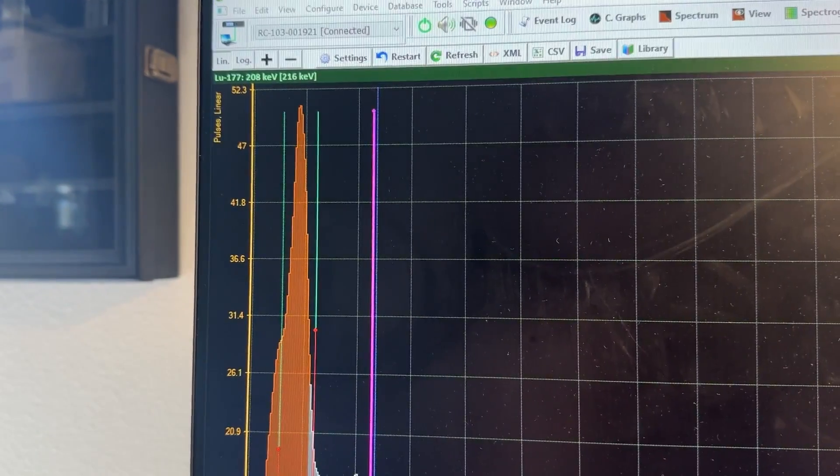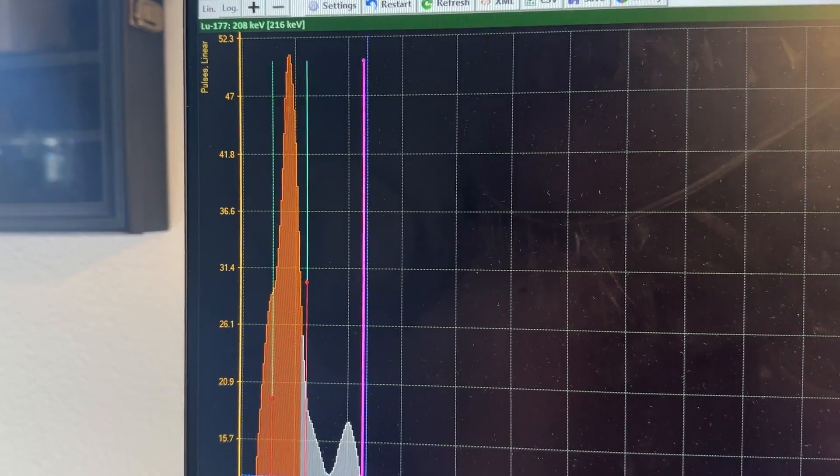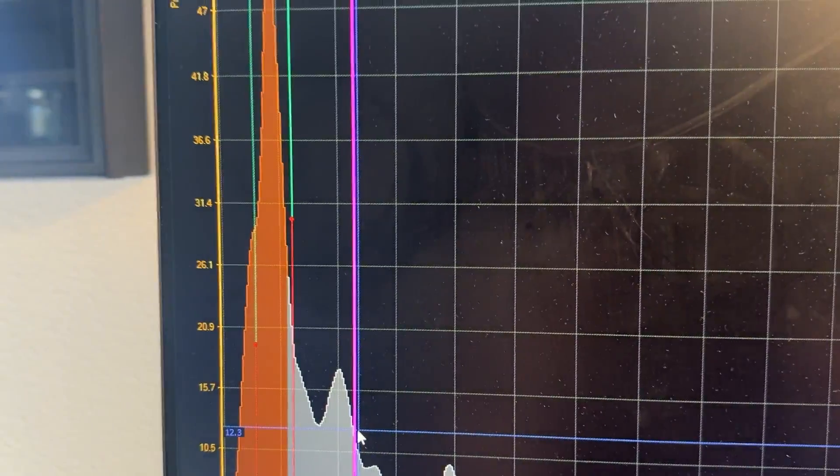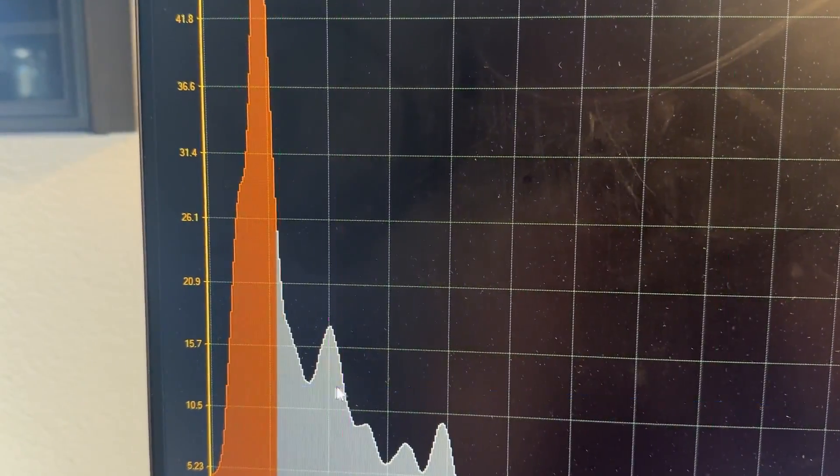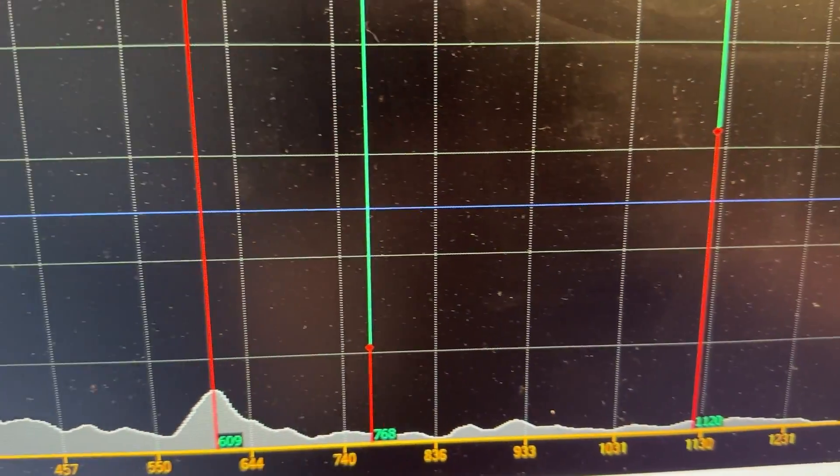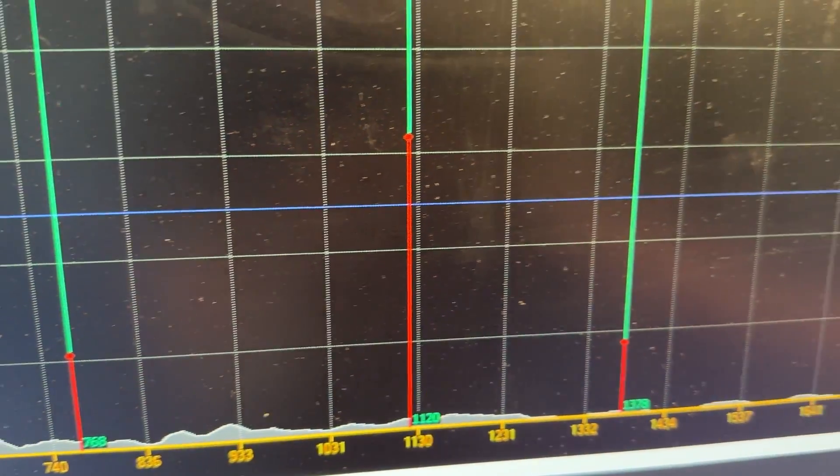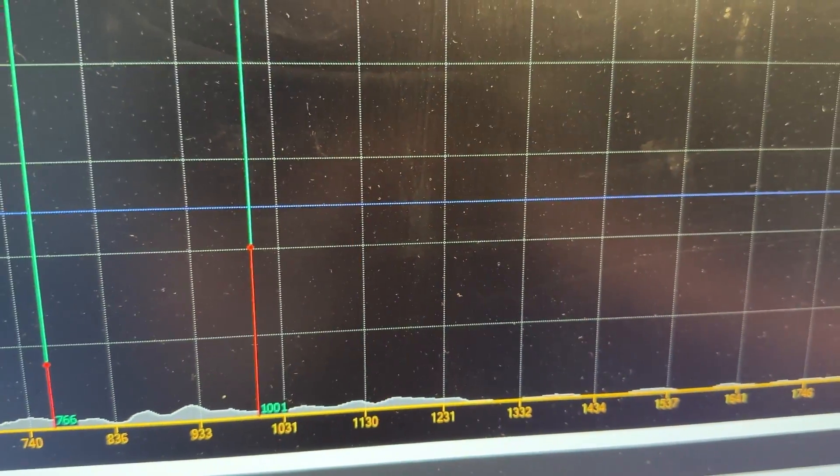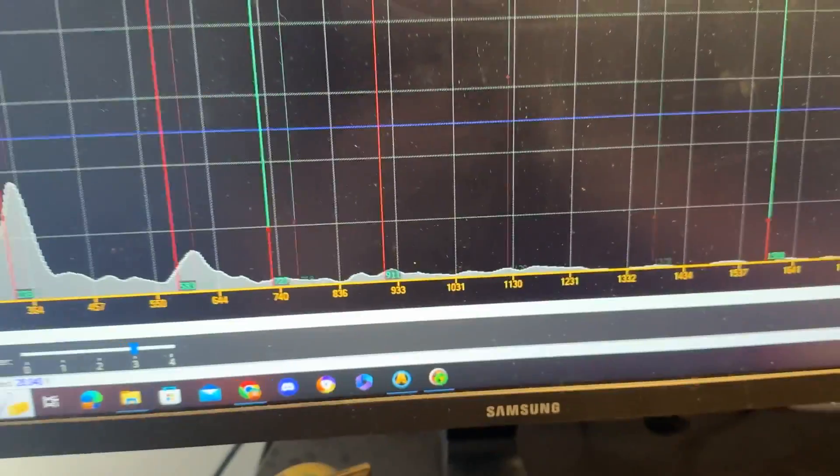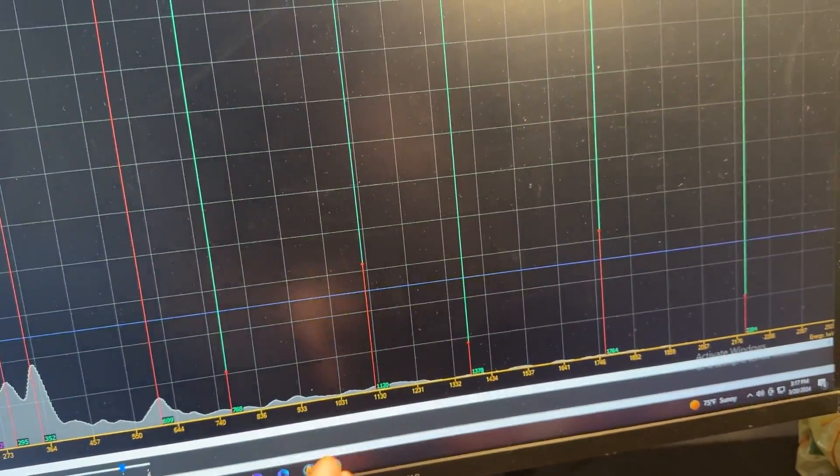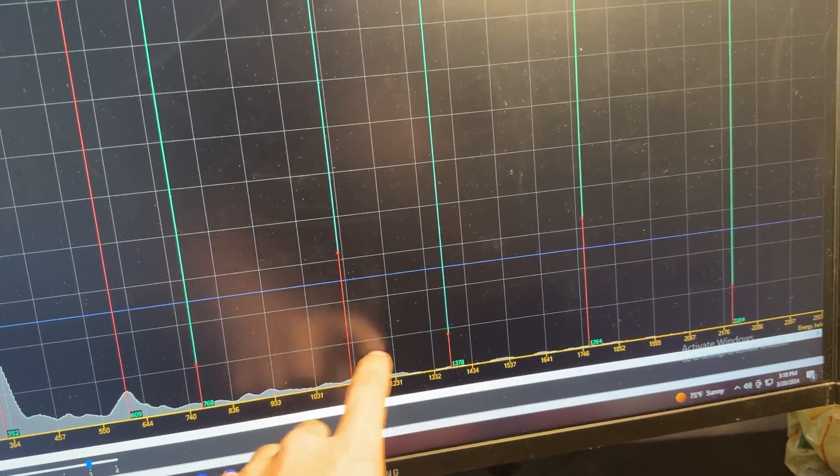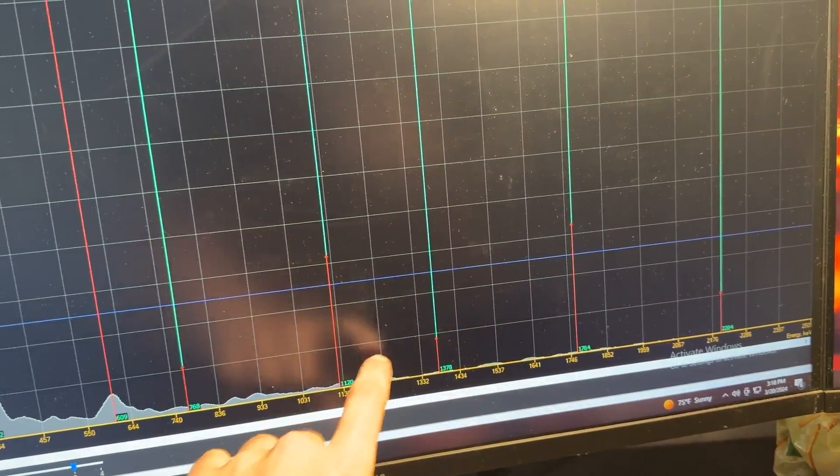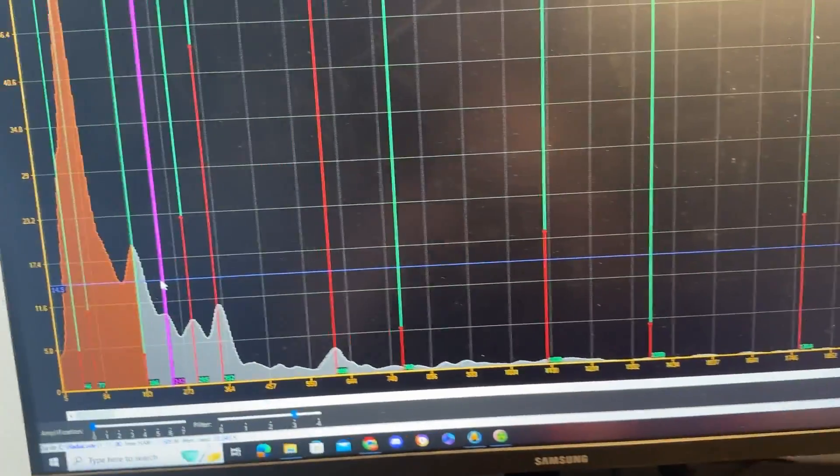So this right here. It's not lutetium I think 177. Because we don't have alignment on any peaks. And again some out here where it's not really showing any peaks. Over time you would see a peak out here. You just really need to give it time for it to build that spectrum. Because it's not emitting very many gamma rays at these energies. So it's going to take a while for that to build.